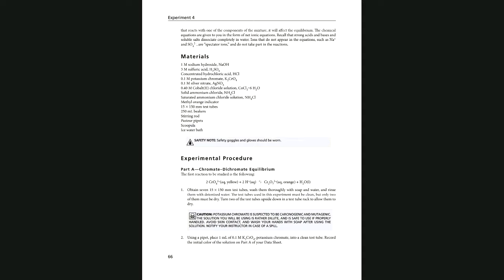But in 1046 class lab, you should say the addition of sulfuric acid, or H plus, disturbed the equilibrium, and the reaction shifted to form more product to cancel or neutralize the pressure of additional concentration of H plus. So be careful when you are recording your observation; you should record it more scientifically. It's going to help you to fill out your data sheet easier and better.